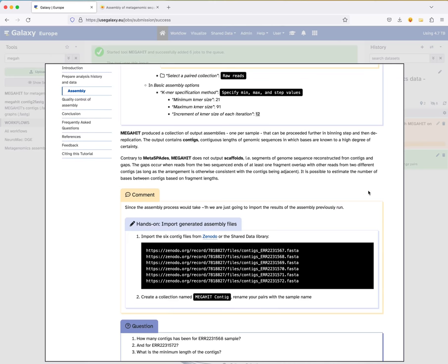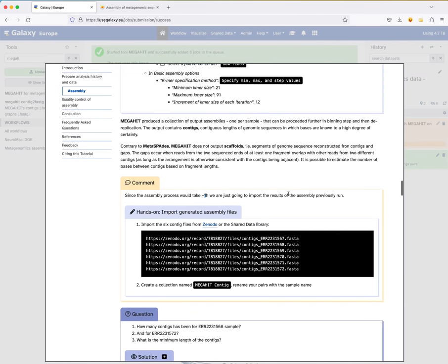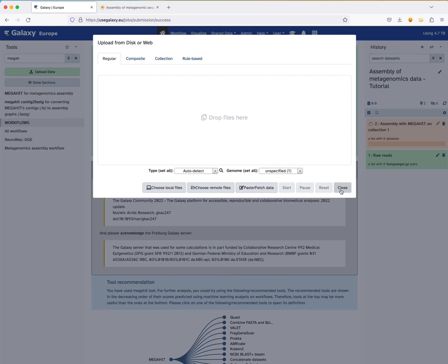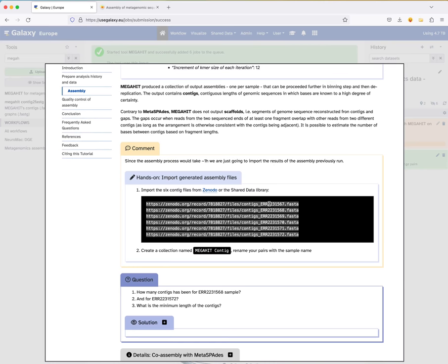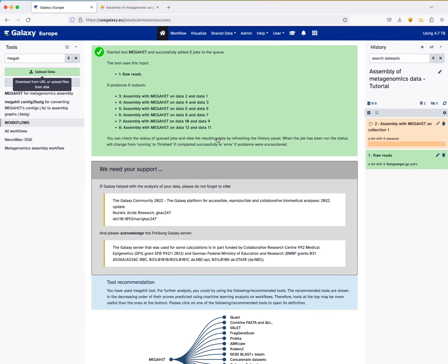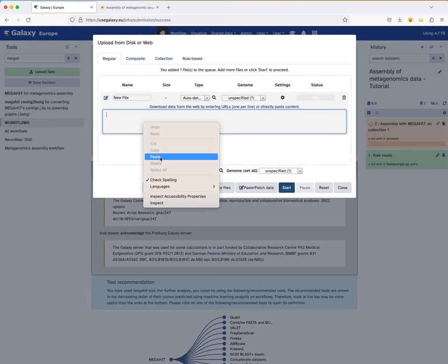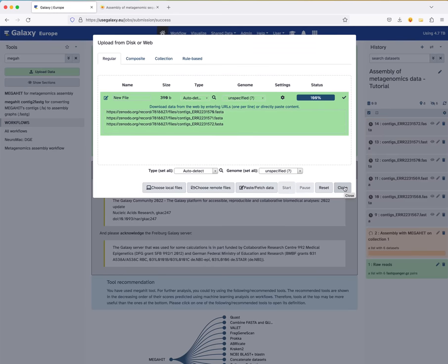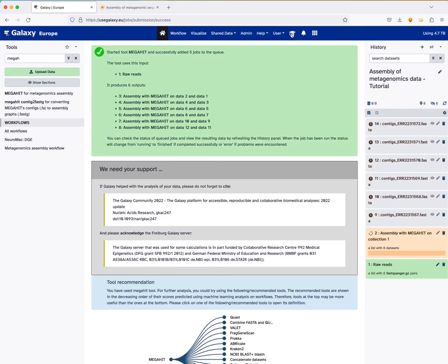Because the assembly tool will take around one hour to run, we already ran it for you. You can import the pre-generated contigs from Zenodo by going to 'Upload Data,' clicking 'Paste/Fetch Data,' pasting the Zenodo links, clicking start, then close. You can then create a collection again, this time a dataset list rather than paired. Rename the files to remove the file extension suffix and keep just the sample names, then create the collection named 'megahit output.'